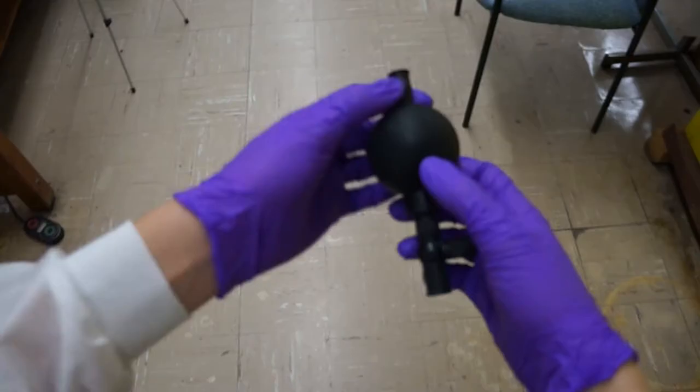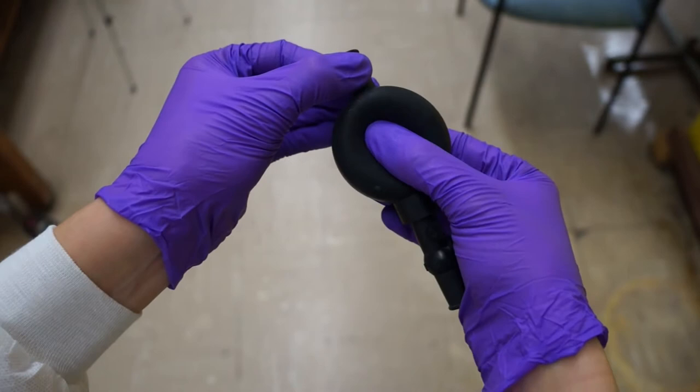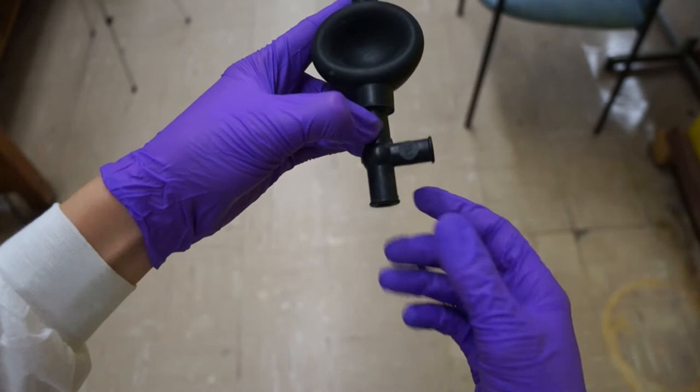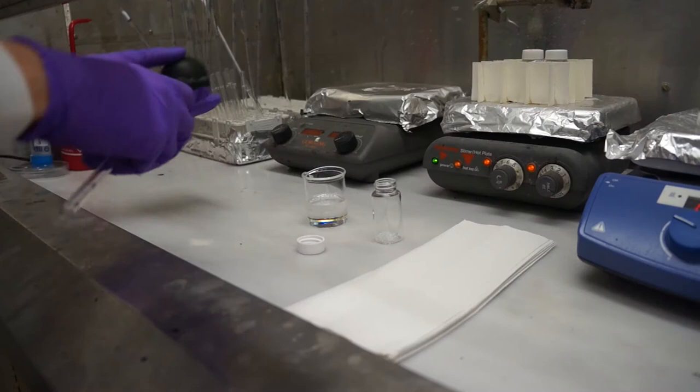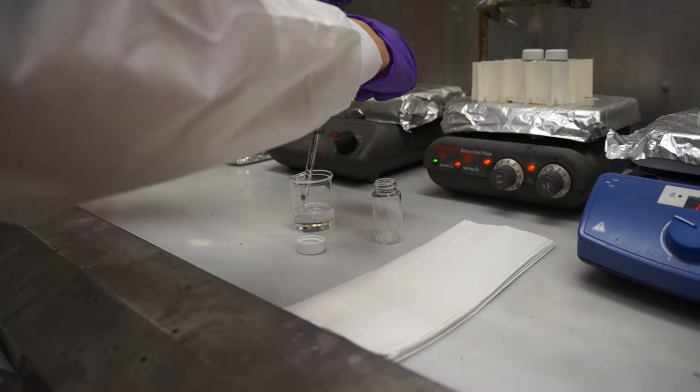To pipette our toluene into our scintillation vial, we're going to need to know how to use this bulb. You need to create negative pressure so that you can have suction. You can press down on the bulb while squeezing the A for this. Then you can draw up liquid by squeezing on the S, and you can evacuate the liquid by squeezing on the E. Now you can use your glass pipette to transfer 20 milliliters of toluene from your beaker to your scintillation vial. Make sure to take note of the markings on the pipette.